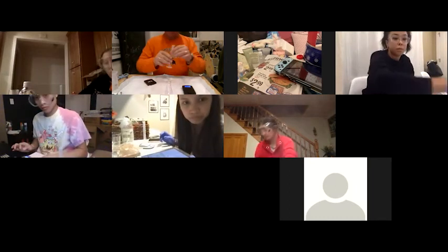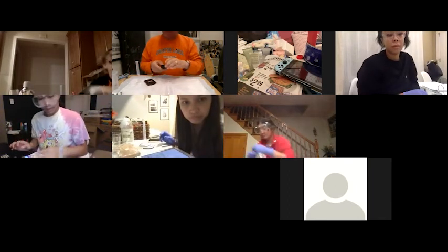So I transfer that to my clean, and I can't emphasize this enough, clean 25 ml flask, because tonight you will see why flasks have this particular shape. There is a reason for it. And you can just give it a little tap, make sure you got all of it.